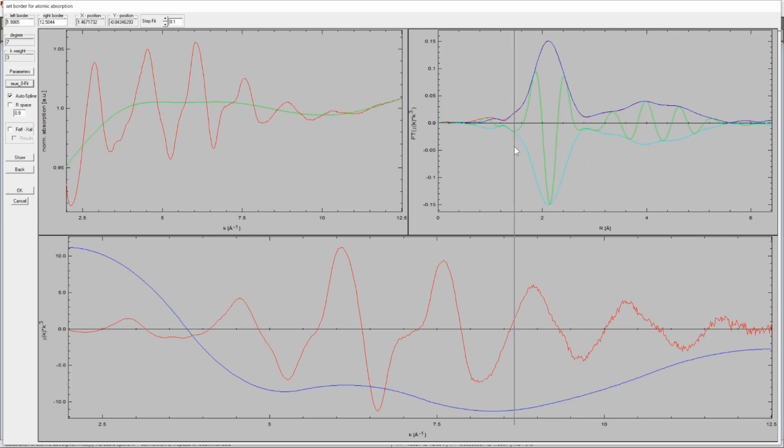Having said this now several times, apparently for this tutorial, this example just serves to introduce the general procedure. It is not so well suited to show the potential problems and potential pitfalls of the atomic absorption correction. But don't worry, I will be covering this with a different spectrum, a different sample, in another tutorial.